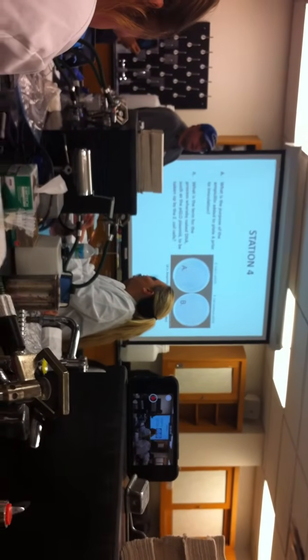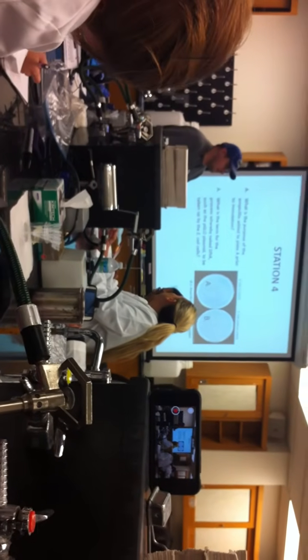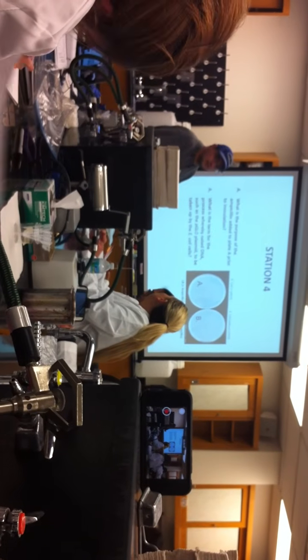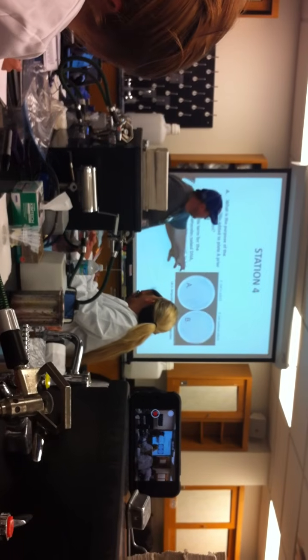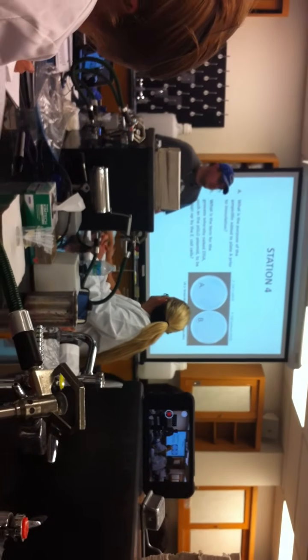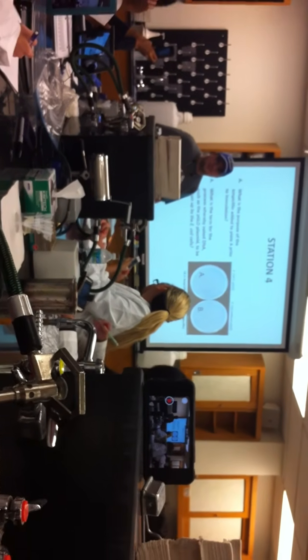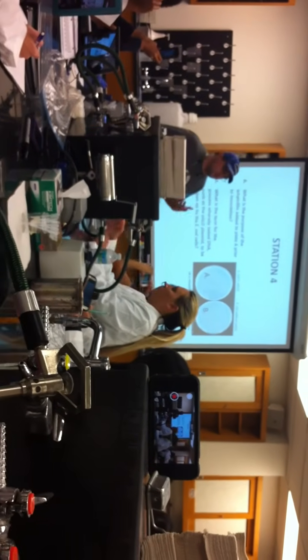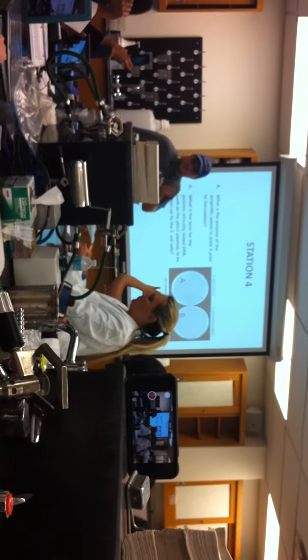We just went over how antibiotic resistance works. So how does antibiotic resistance work? You destroy the antibiotic. So if these green cells are destroying the antibiotic, then the other cells are able to grow too. Those are called satellite colonies because the transformed cells are destroying the antibiotic. Does that make sense? Okay?